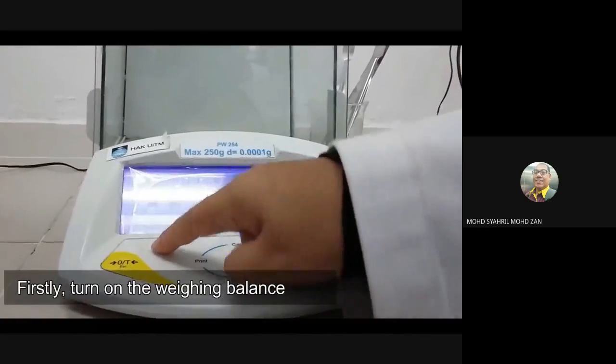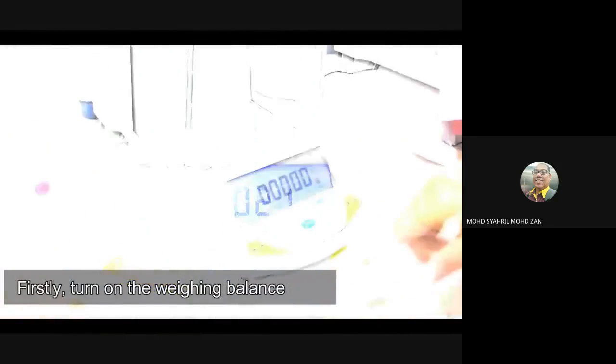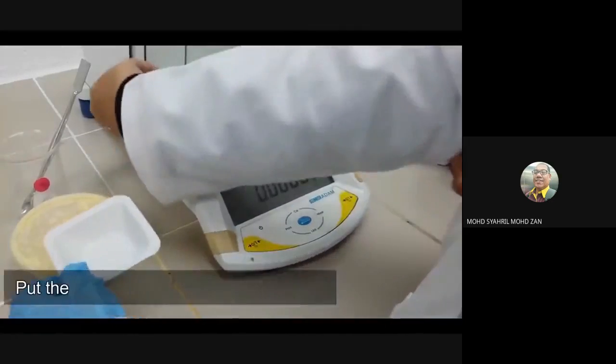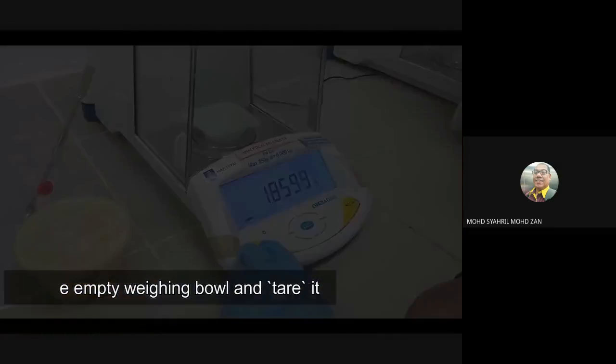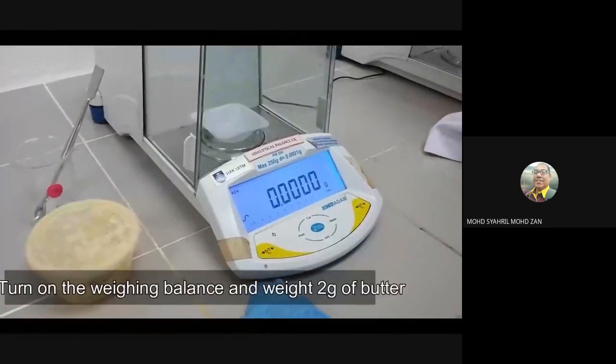Firstly, turn on the weighing balance and weigh 2 grams of butter.